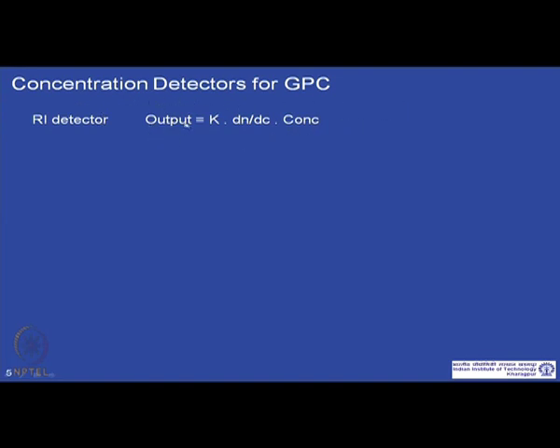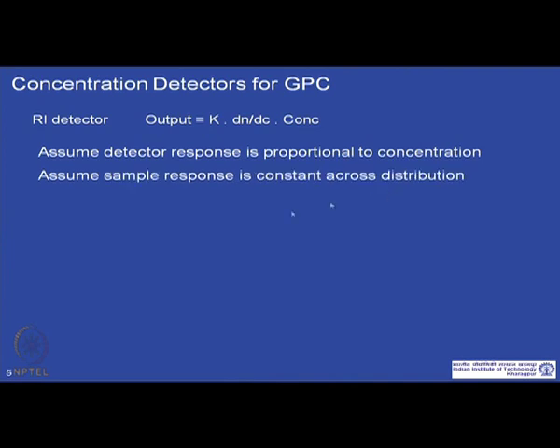So, the output signal in this detector is proportional to the concentration in the range we are working, and also this response does not depend on molecular weight.